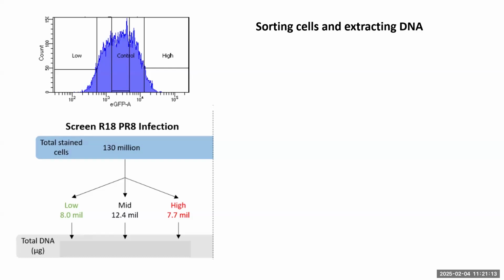So we started at 16 hours and we found that we had to pull that back to 12 hours to really get a good balance between signal and cell death. And the student was delighted with the 12-hour time point. But these are the things you have to do when you're a student. So yeah, that's kind of key.